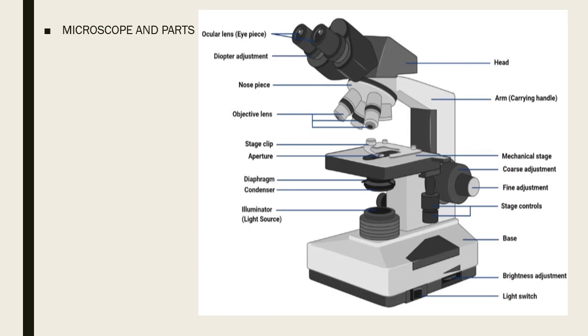Moving on, let's take a look at your microscope. Others, of course, you have here other instruments that are utilized in the laboratory. Of course, you have there your glass slide. Your glass slide is where we place your urine sample, the urine sediment for microscopic exam. Other than the use for microscopic exam in urine, we are also utilizing glass slides to stain samples, for example in cell count, when we do differential count, we also need to stain.